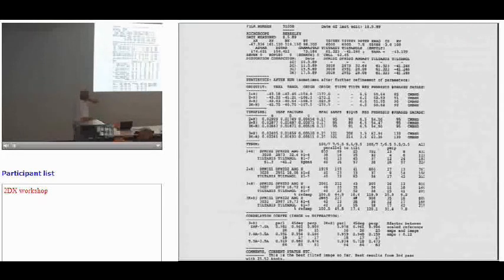So then this is the same sort of summary diagram that we used for the tilted pictures. And again, it's vintage 20 years. So here is 4 passes of the unbending procedure.